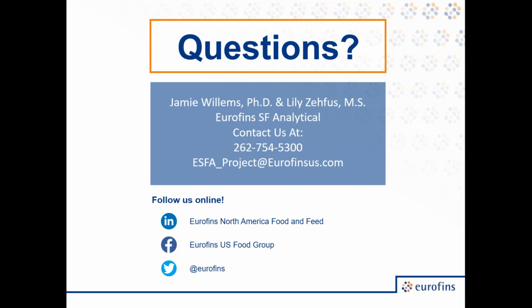Our next question here is, how do you know if a difference in profiles is significant? Sure. So we have several strategies we use when we are looking at our data at the end of this process. We have to consider, based on the product, what compounds would we expect to see, and would we think that would be naturally occurring.